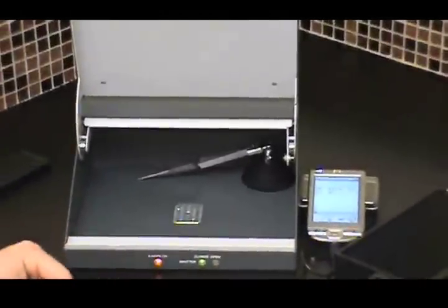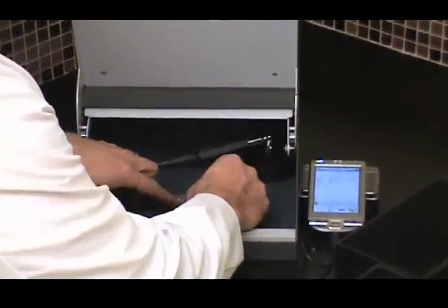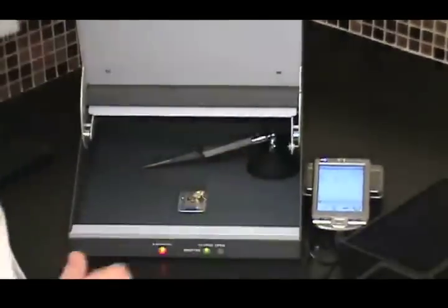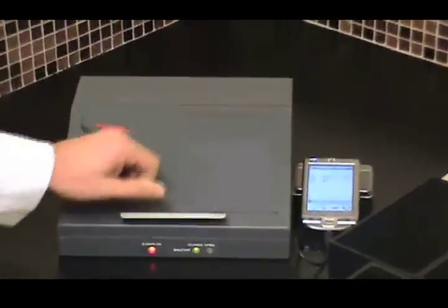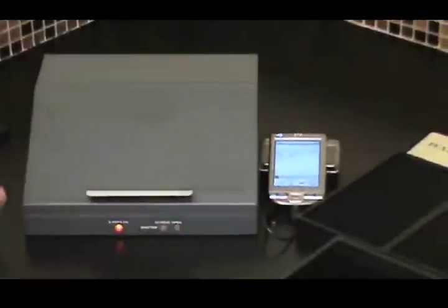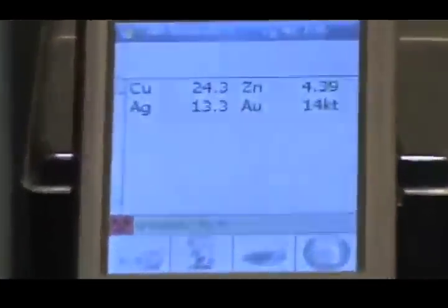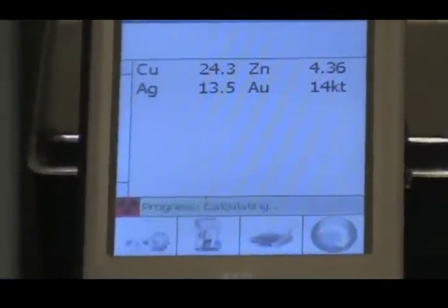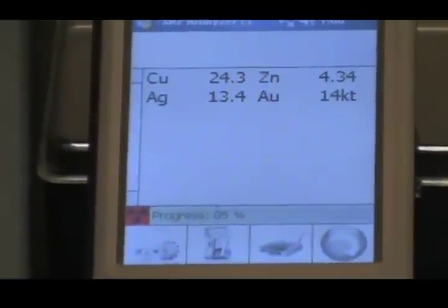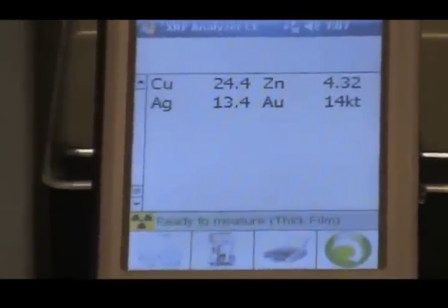First I'm going to put the earring in. Now I'm going to x-ray it. Within 10 seconds, we get a complete reading of all metals that are made up in this item. And I'll show you them here.